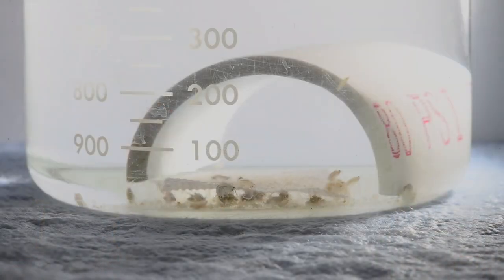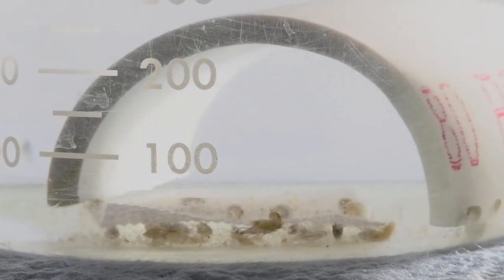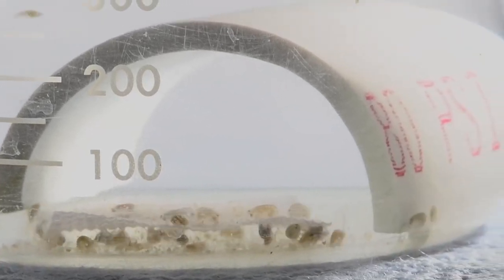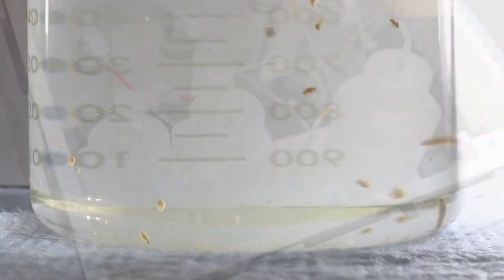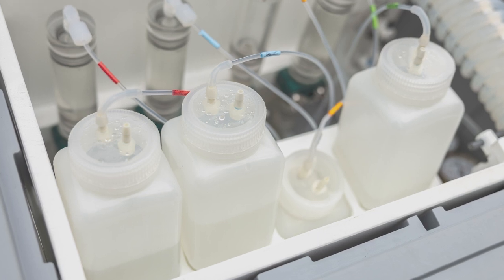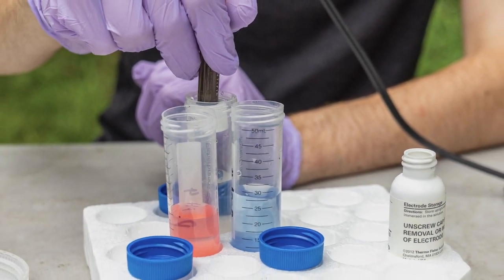After the water has been chemically fractionated in the resin chamber, it will slowly flow through the organism chamber, where various test organisms can be placed. Acute and chronic toxicity responses in those organisms can be observed and assessed. To date, we have successfully used freshwater daphnids, freshwater amphipods, mysid shrimp, and larval minnows in the iTIE system, though other test organisms can be used as well. Finally, the water is collected in sample bottles for additional water quality testing at the end of the run.